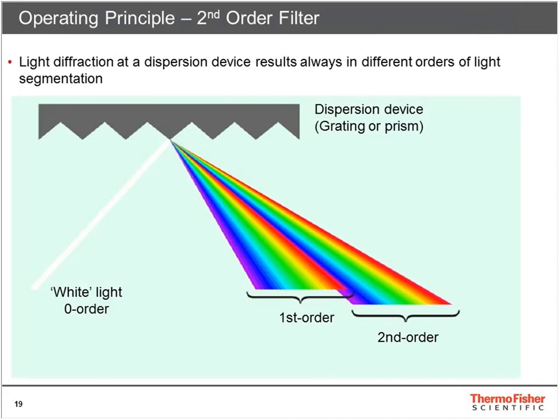When you split up the light, you'll get something like a rainbow that sends the light to a diode array that measures the intensity of the different wavelengths. Have you noticed that when you look at a rainbow, there is actually one more rainbow with less light close to it? It's a second-order segmentation and also happens in a detector.